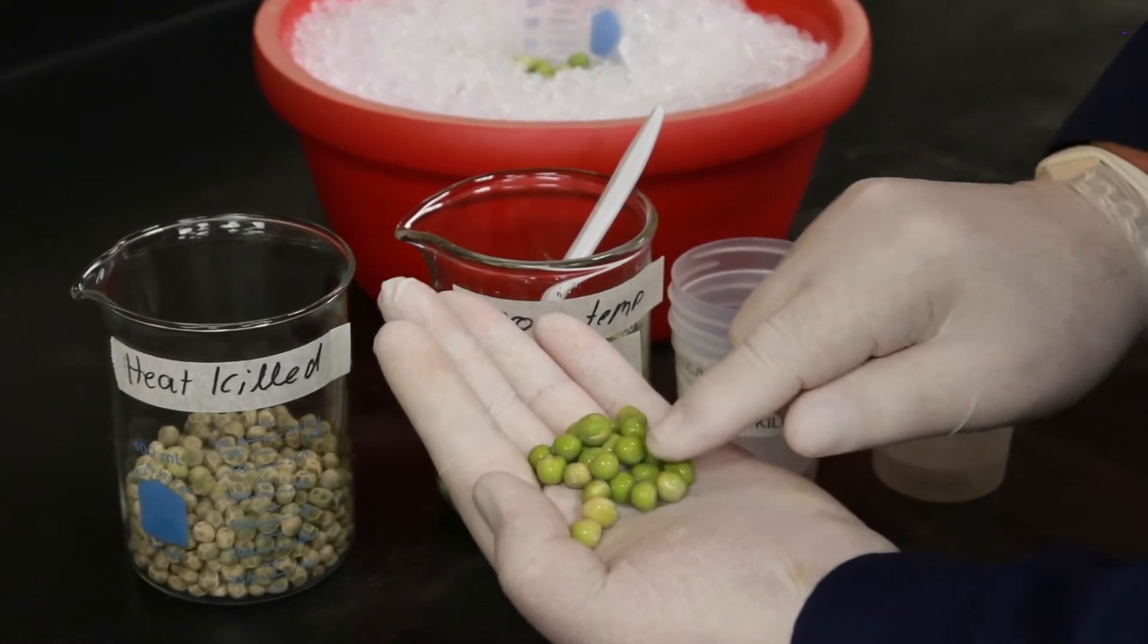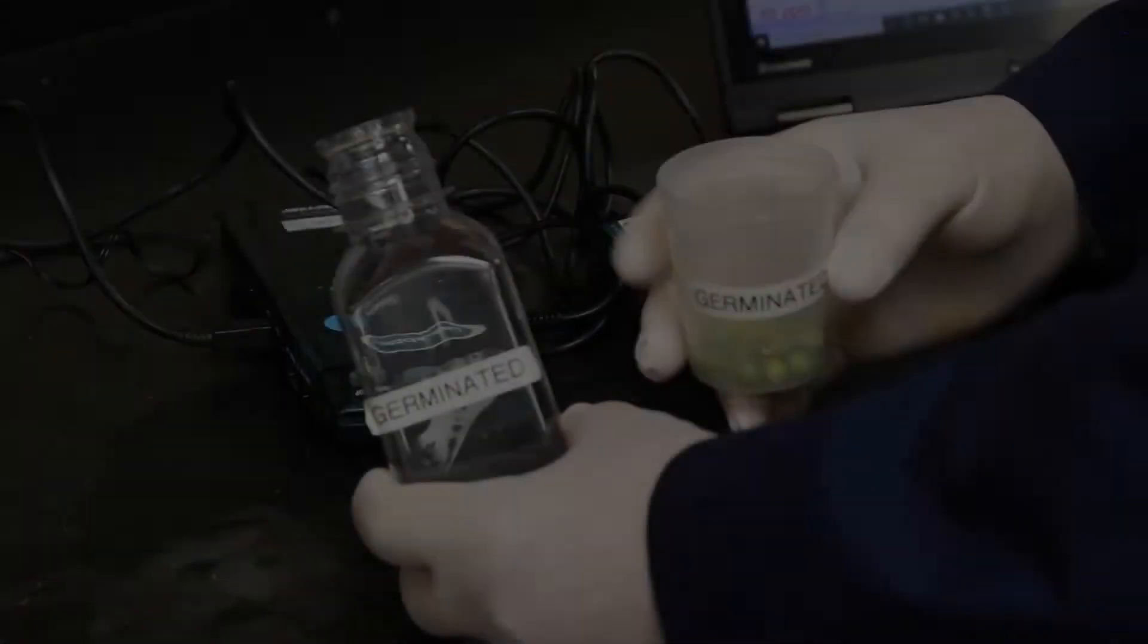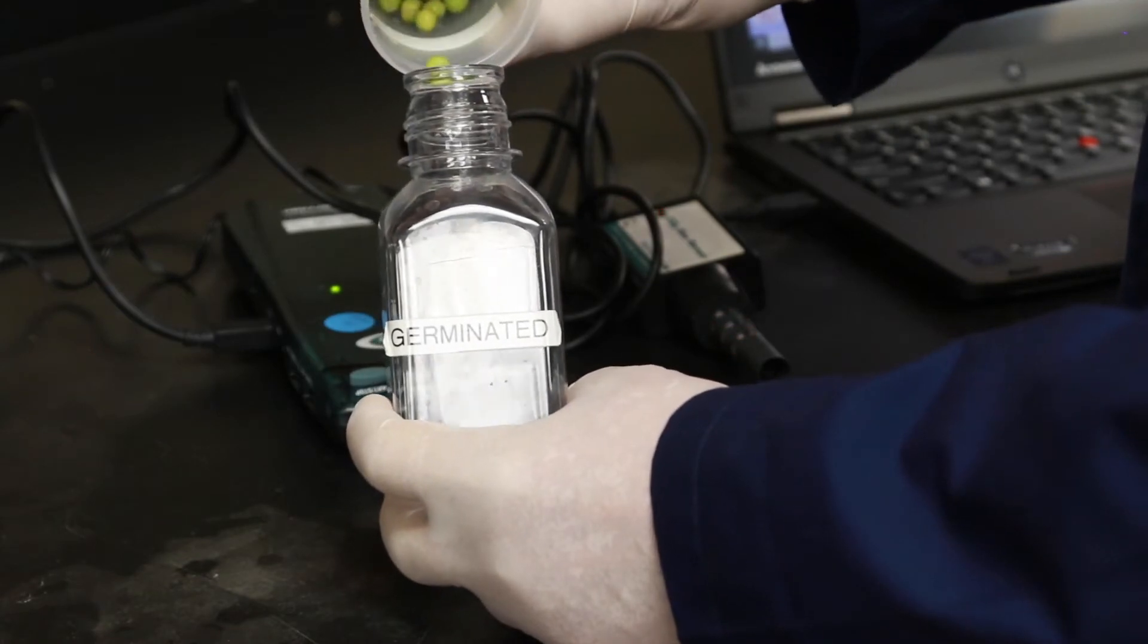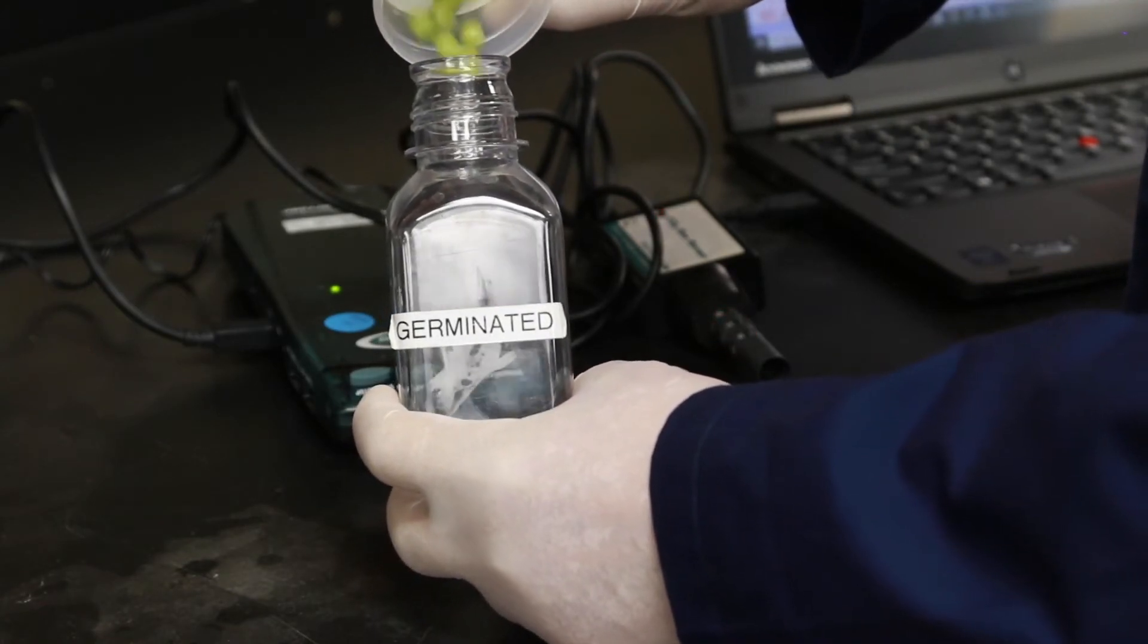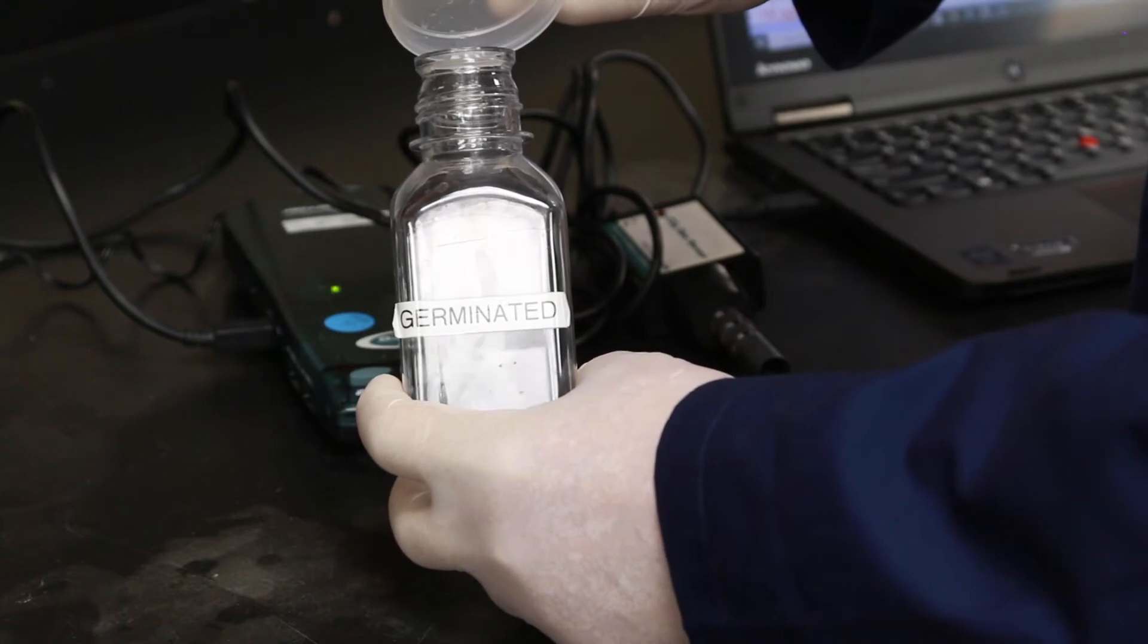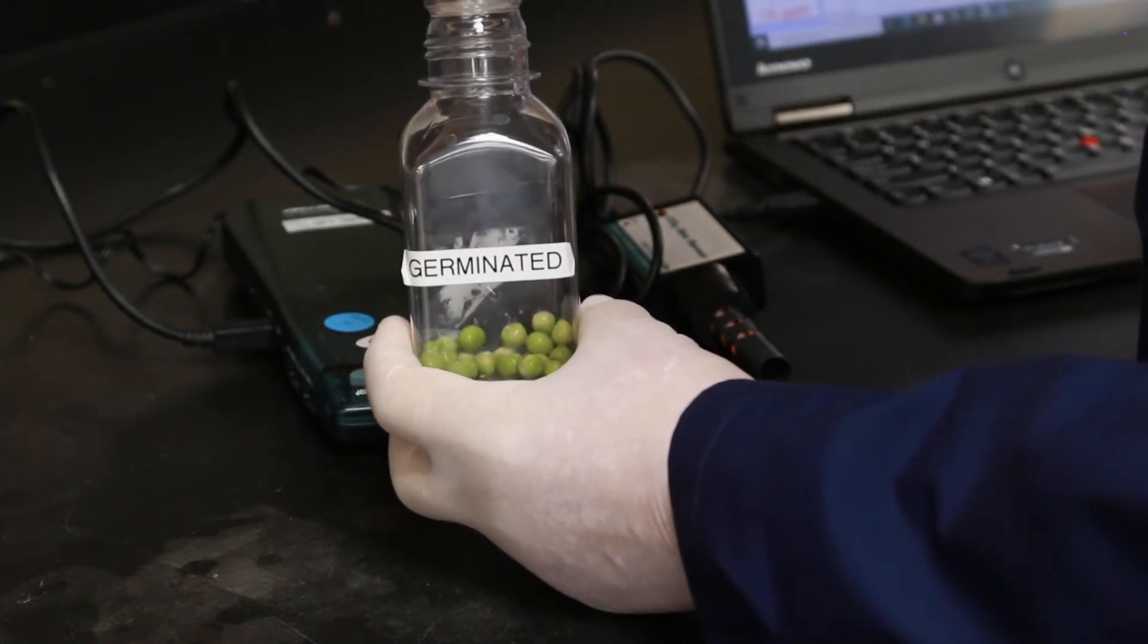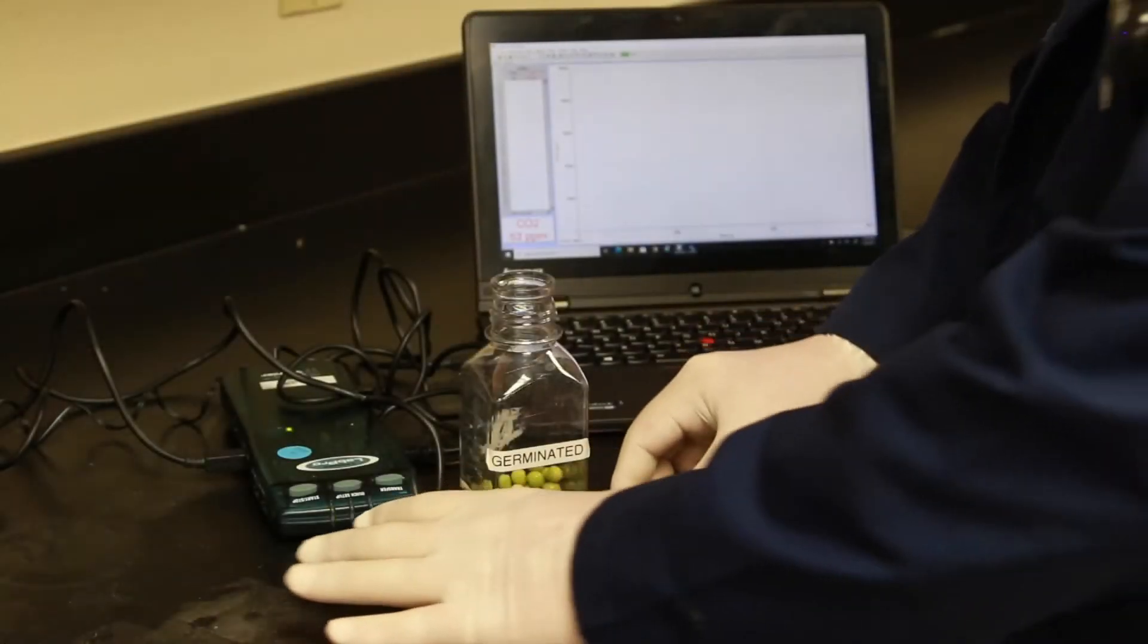The 25 peas are going to be counted out and they will then be placed in a large plastic flask. This flask is going to be used to measure the CO2 production from the cellular respiration that's occurring within the peas. Although peas are plants they do still carry out cellular respiration.